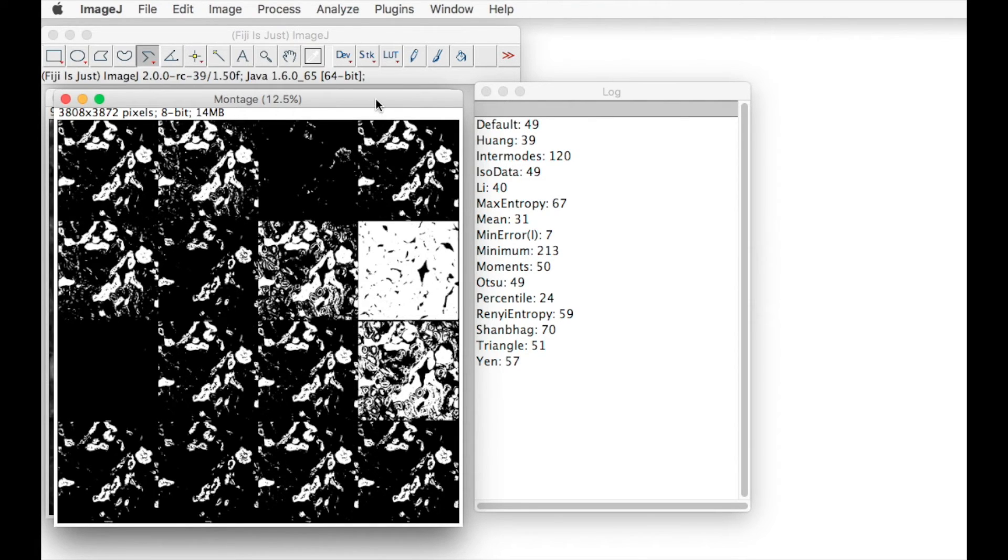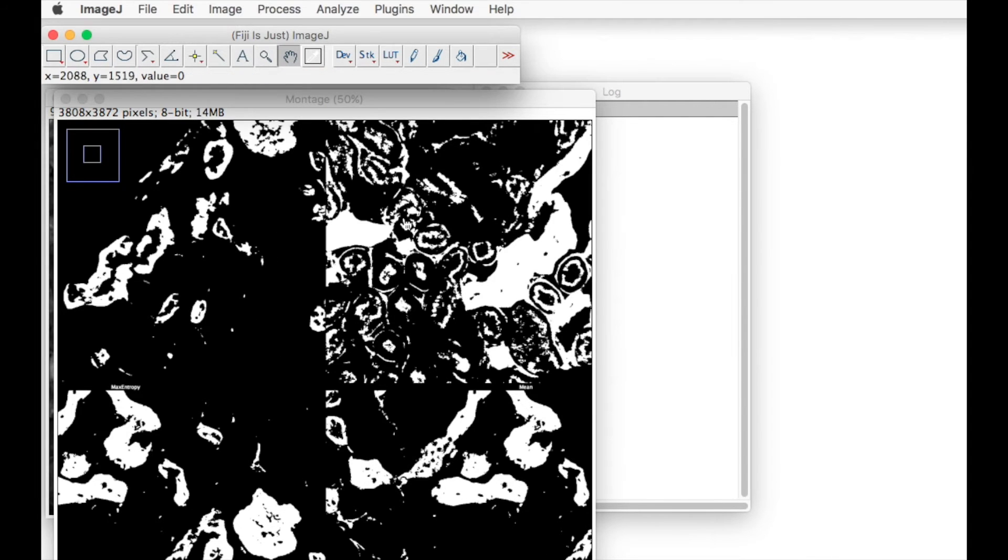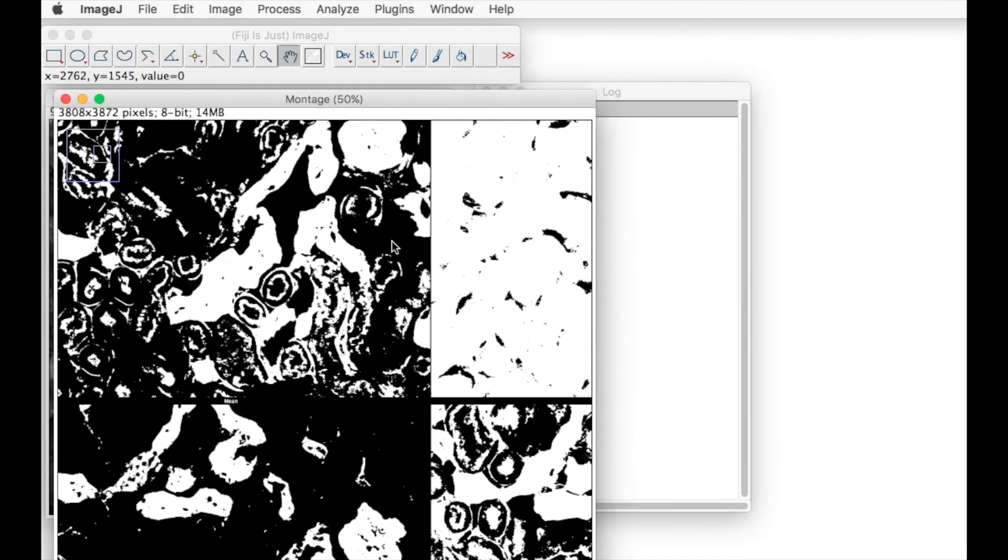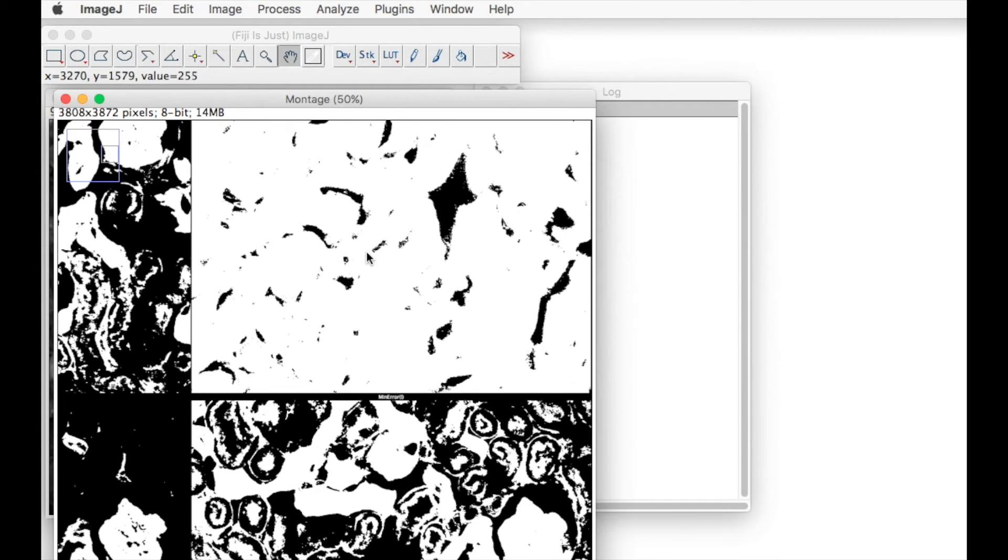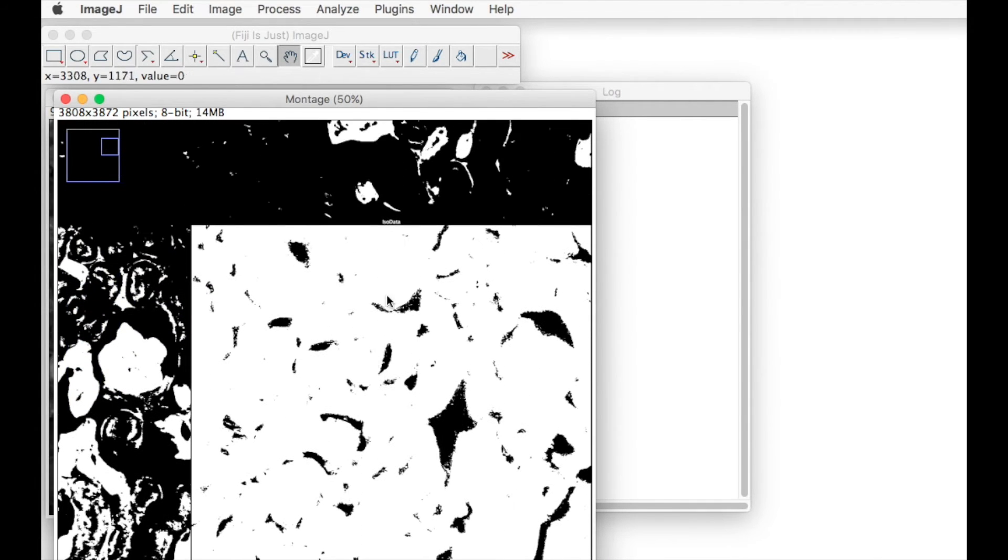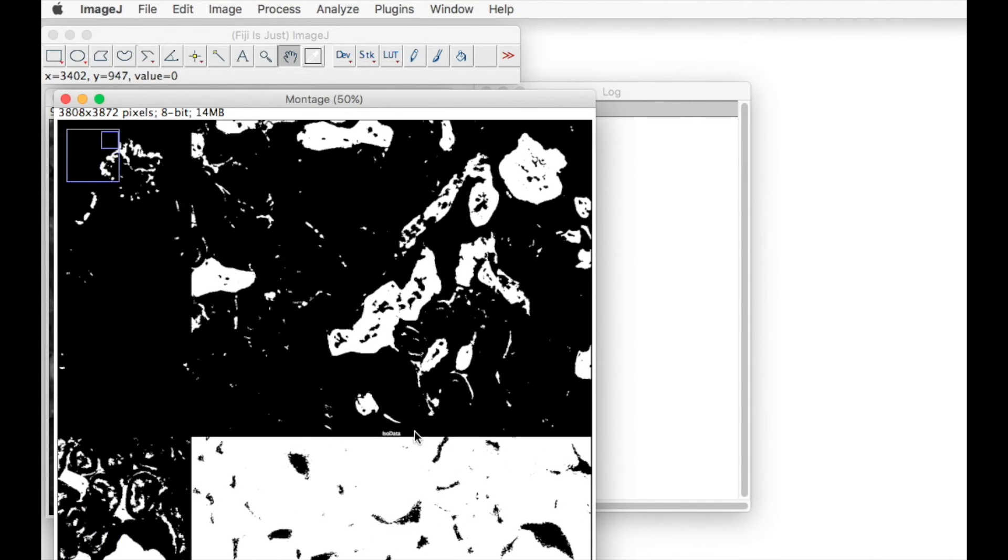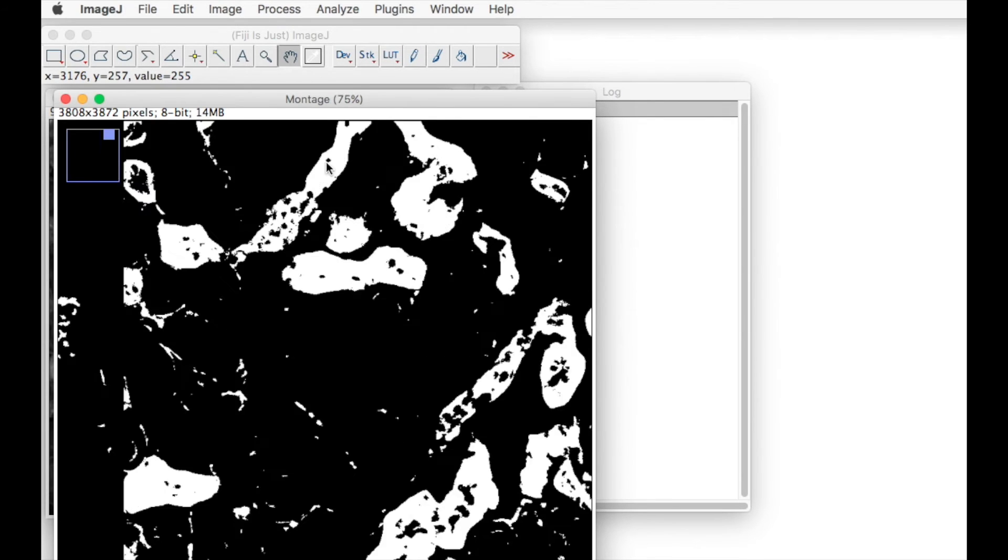This one in the top right looks the best for the analysis that we want to do. So we can use the pan tool to move across the montage to have a closer look.